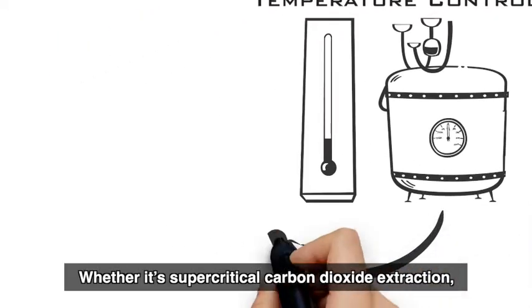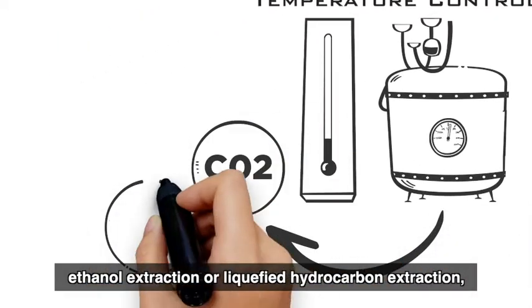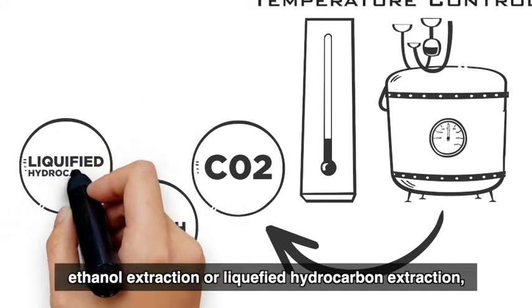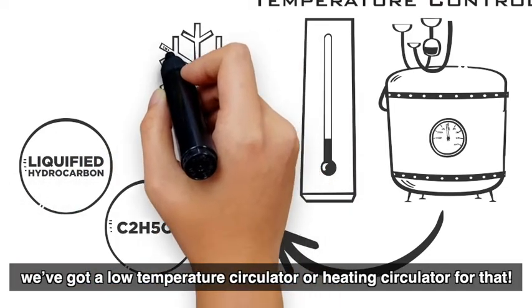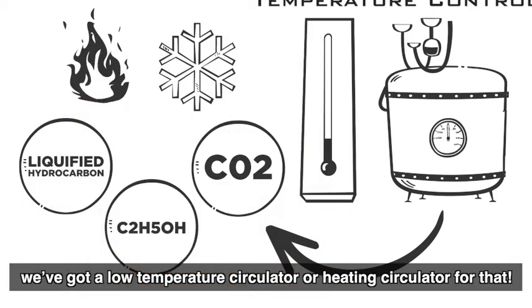Whether it's supercritical carbon dioxide extraction, ethanol extraction, or liquefied hydrocarbon extraction, we've got a low temperature circulator or heating circulator for that.